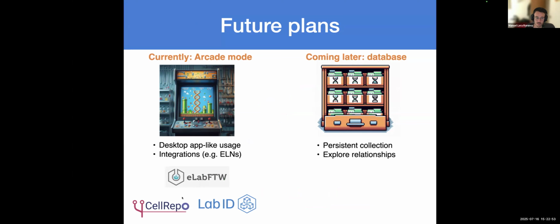And in the meantime, I'm also doing integration with electronic lab notebooks so that, if you are using an electronic lab notebook in which you have a database, you can read sequences from there and clone using OpenCloning and then save to your electronic lab notebook. And I already built an integration with eLab FTW, which is an open source electronic lab notebook. And this is already live and it's being used in some universities.